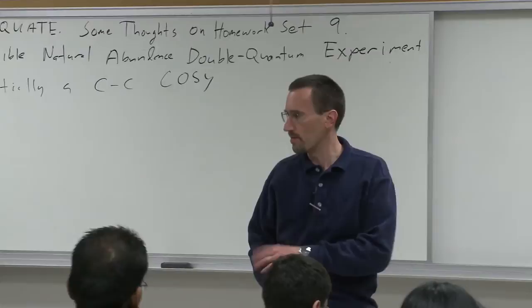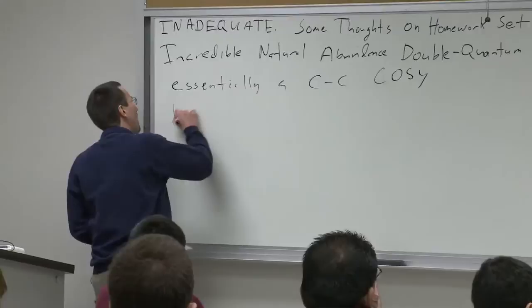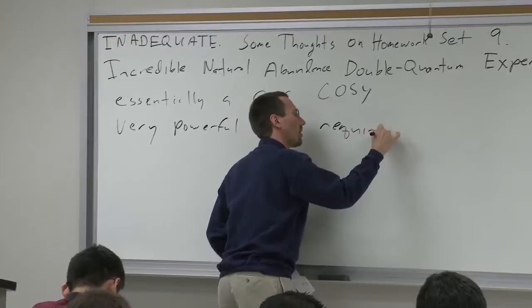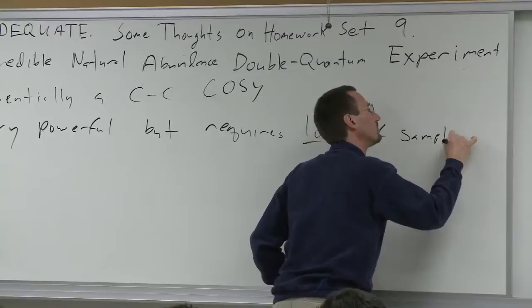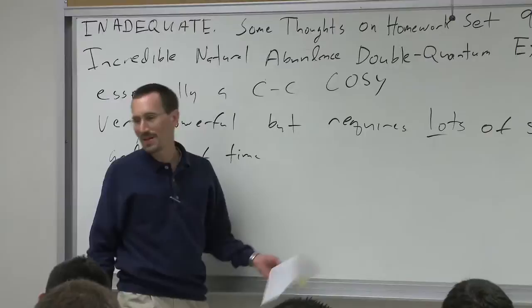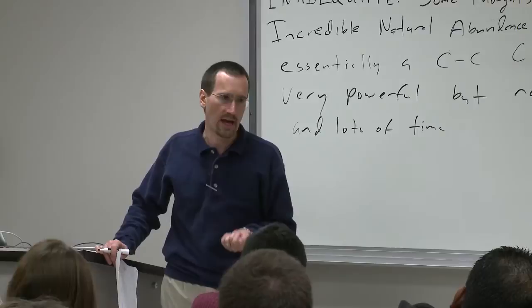And what's inadequate, of course, about it is the amount of C13. So I'll say very powerful, but requires lots of sample. And lots of time. So by lots of sample, I mean like 100 milligrams. In other words, if you're dealing with some rare natural product where you've isolated a couple of milligrams, right now it's essentially out of grasp.